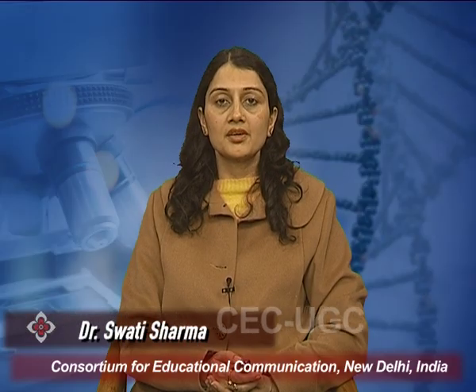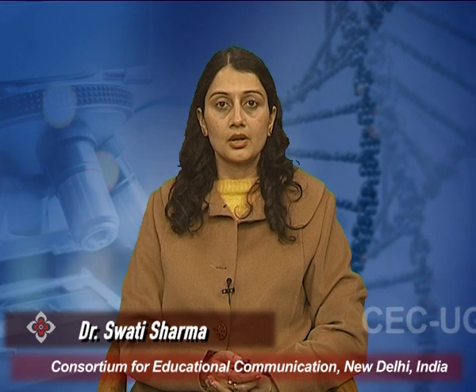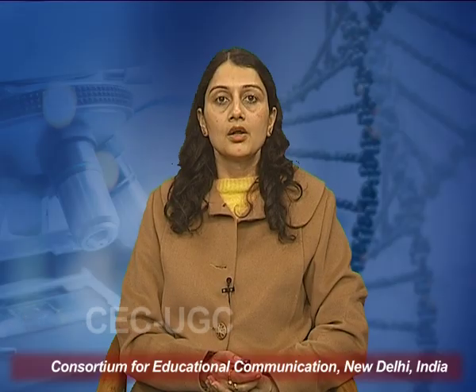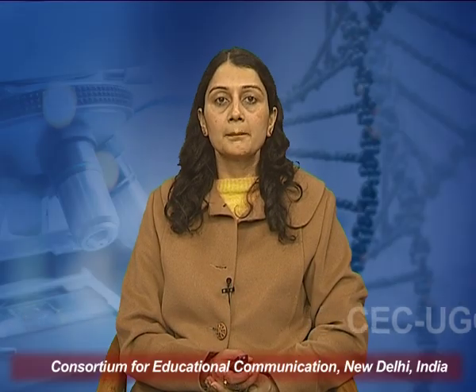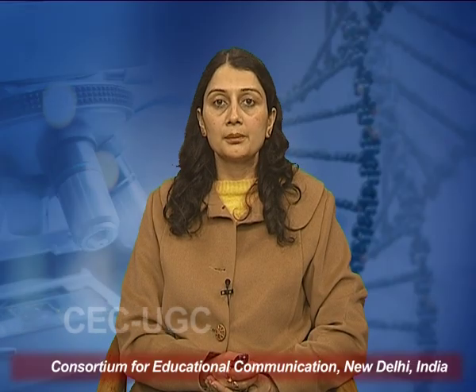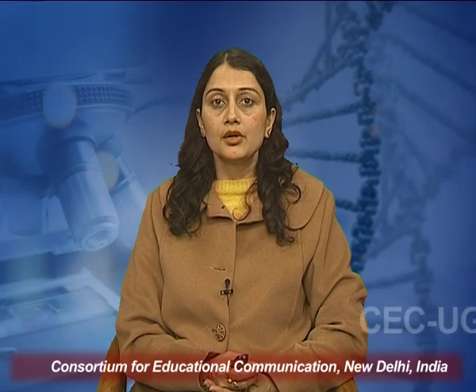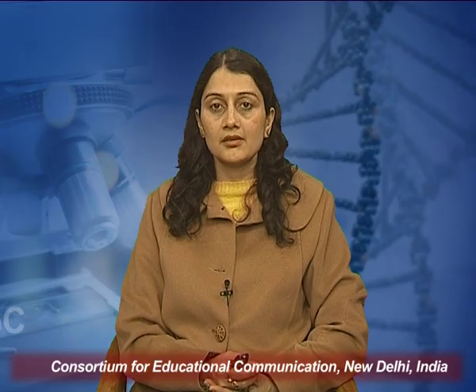Today we would be discussing the media preparation. First of all, you should know what is a media. Media is a medium in which you can grow your microorganism of the interest. In microbiology, you want to culture your microbiome of your interest to study it. So there are 5 basic techniques by which you can study a microorganism.